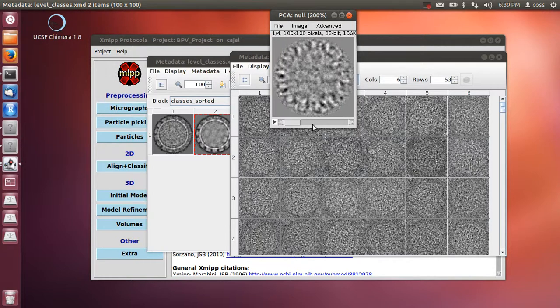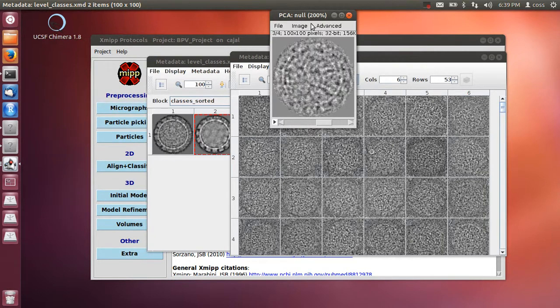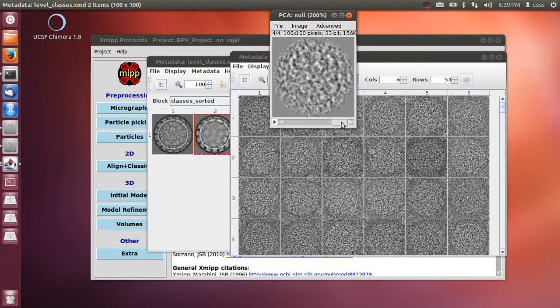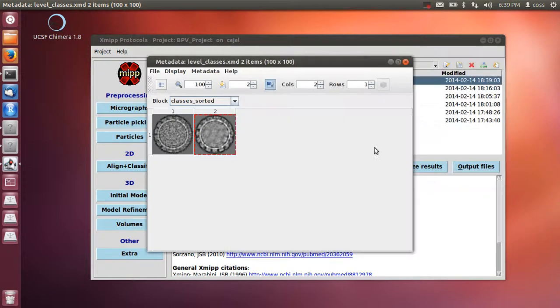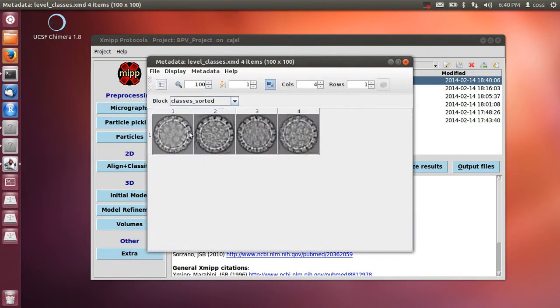This is the second most important difference, here. The third, we see differences between the internal part of the capsid. So all this structure means that you should further subdivide the classes. You may explore the images at level 0, at level 1, etc. These are when the images were split into 4, etc.